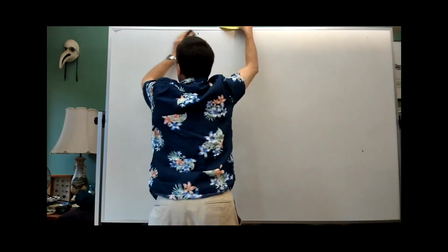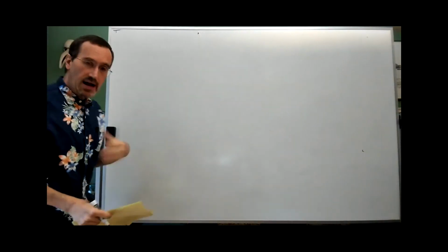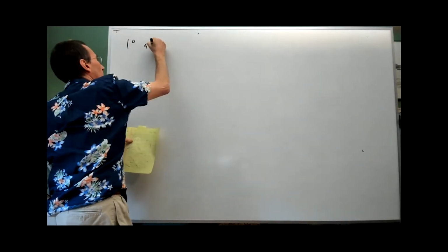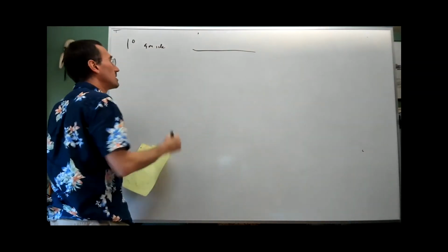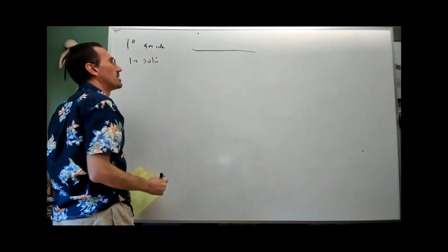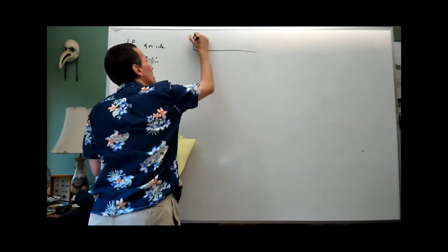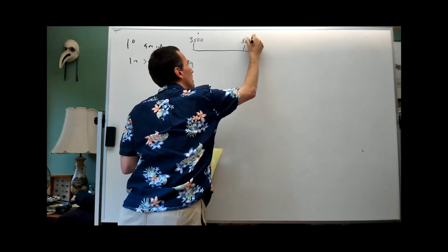And often IR spectroscopy involves reading various clues together, how things look, the shape of various bands. So for example, for our primary amide, in solution, in other words, where you're not hydrogen bonded, and let's just say we're looking from about 3,500 to 3,000.